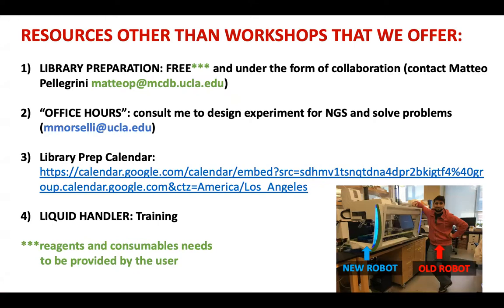Resources that the QC Bio offers that are regarding my workshop, or my fellowship, is I can prepare a library preparation for free as long as you provide the reagents and consumables. So the kits and the pipette tips and so on. It's going to be a collaboration, okay?